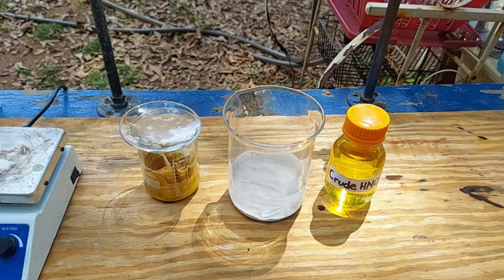I'm beginning to have serious concerns, though, about this powdery stuff, because if it really is precipitated mercury, I would imagine that it would start to consolidate into a liquid. But I haven't seen any more liquid in here than what I poured in to begin with. It doesn't seem like it's happening to more of it. So I'm beginning to wonder exactly what the hell it is. I'm sure it's got mercury in it in some way, shape, or form, though.